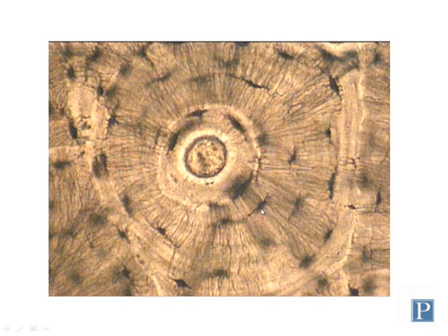So as you can see, with this type of preparation of bone, you observe the bony tissue in a very different way. In reality, bone does have this very intricate extracellular matrix, but it also is filled with lots of living cells, which are preserved using the decalcification method.